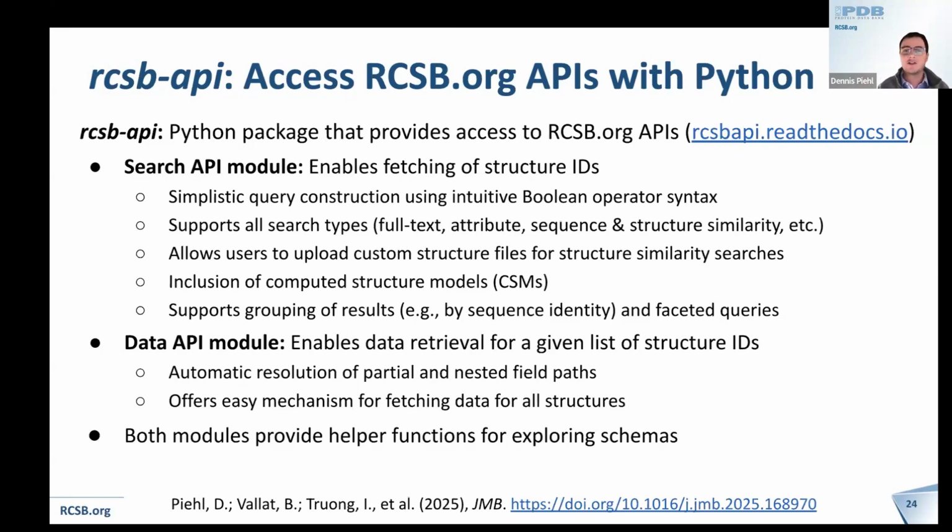You can also include computed structure models in your search, and you can also group your results, such as by sequence identity, as well as performing faceted queries, which allows you to aggregate results based off of some attribute.